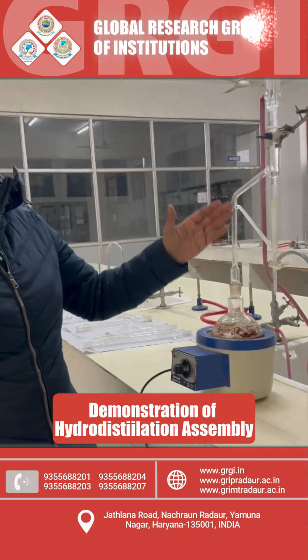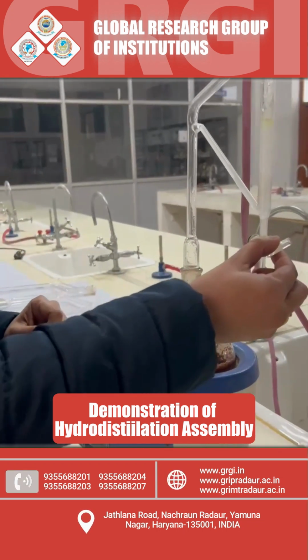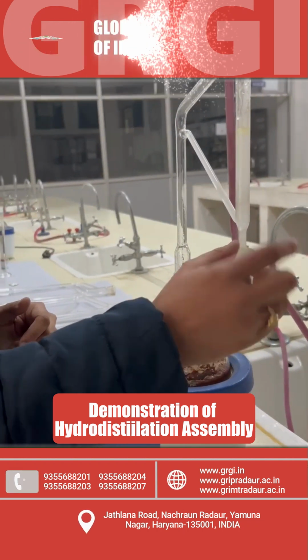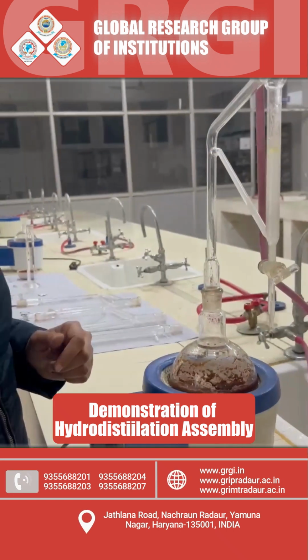After the completion of this process, we can collect our volatile oil from this outlet. This is just like a burette. We can open it and collect. First of all, we will release the water layer, and after that we will collect our volatile oil.